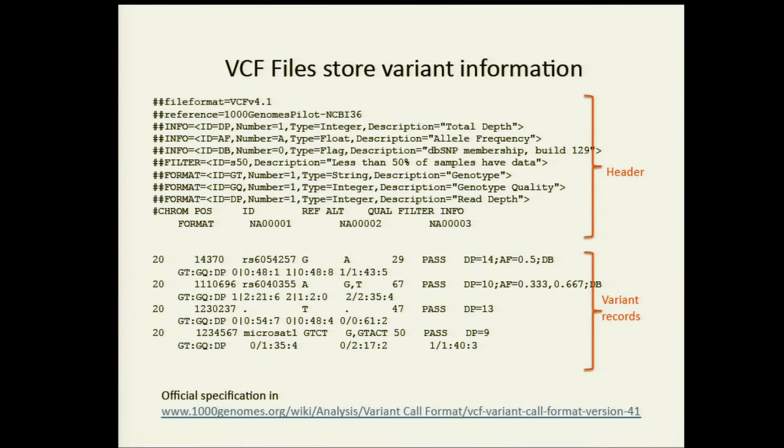Now the next sample, NA0002, is 1, 0. That means 1 represents this base here. So the genotype here is heterozygous. There's a G and an A with 8 reads. So we're a lot more confident, potentially. And then this sample here is 1, 1, AA. So this sample is homozygous variant.